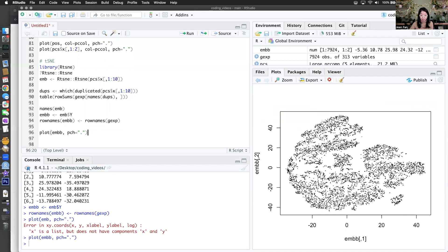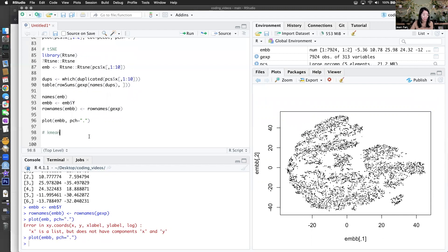We see some groups of things — that looks fine. But we might want to actually identify what these clusters are and grab them out. In theory, I could try to grab a group of cells that are close to each other in the t-SNE — they're transcriptionally similar in PC space, which means they're transcriptionally similar in general. But it's too tedious. So I'm just going to do a clustering in PC space. I'll be up to students to figure out which space they want to do clustering in. I'm just going to use k-means.